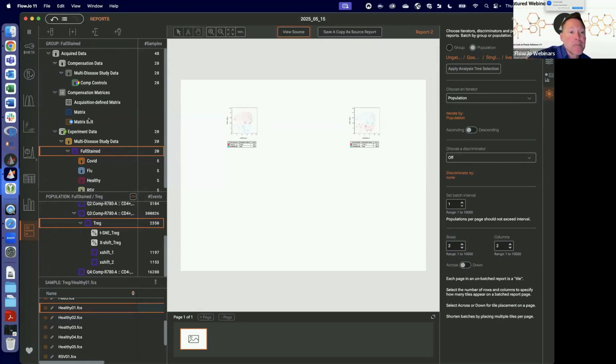Let's see, we have a question about, oh okay, there's a few questions here. Charts and tables are live. You can subsample in all of the tools that are done for calculations. If you were going to subsample just for the purpose of showing a plot, I would probably just use a contour plot or something. And can you show some imaging data?